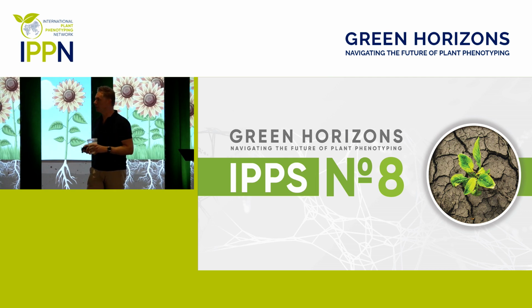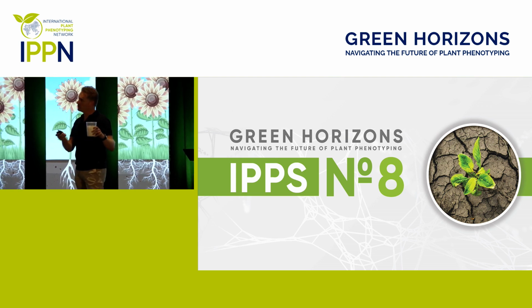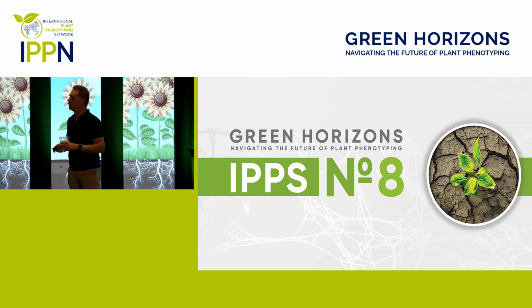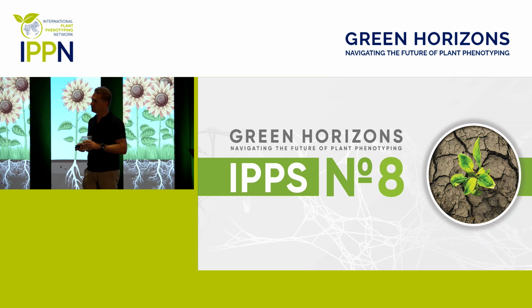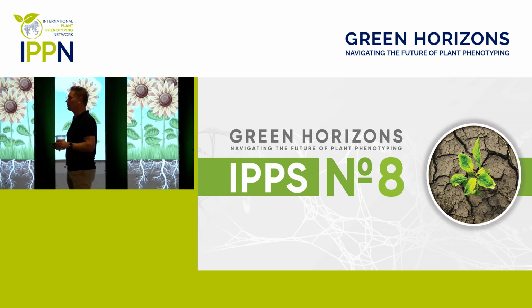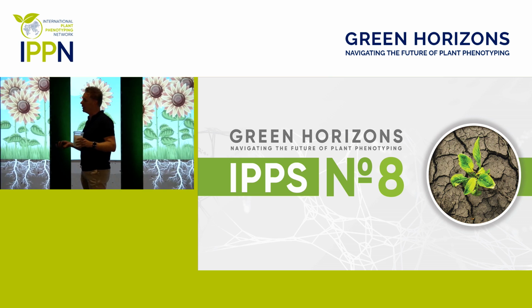And in the potato experiment that was also demonstrated, it was a duplicate test. One set of the plants was regularly exposed to X-ray and the other one not, and there were no visible effects. Right. So does that mean that there are some species that are more sensitive than others? We have not observed ourselves any kind of influence on the development of plants as a result of X-ray radiation. That's the answer I can provide you.